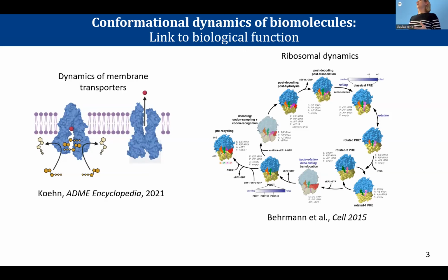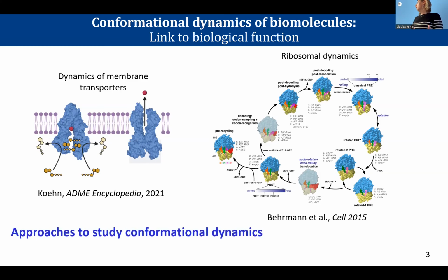Conformational dynamics of biomolecules is very important to structural biology. These conformational changes are directly linked to the biological function of the complexes. So the complexes change their shapes in order to accomplish various biological functions. And how can we now study this conformational dynamics?